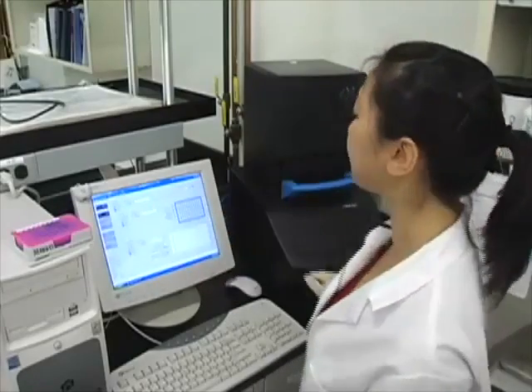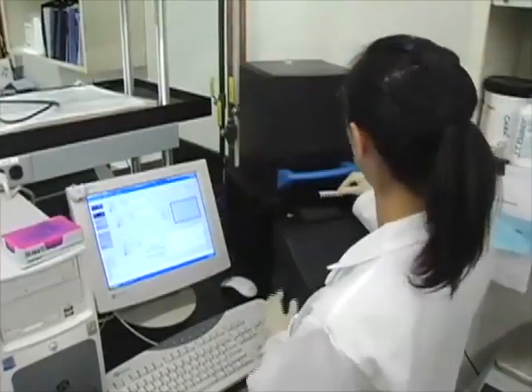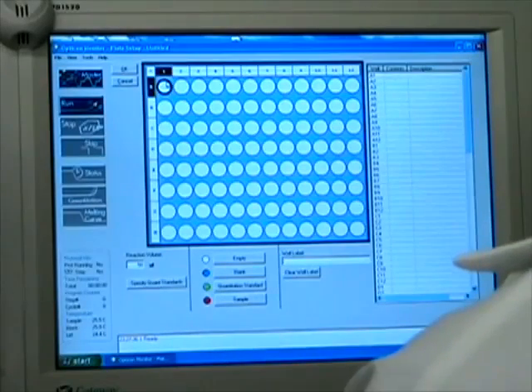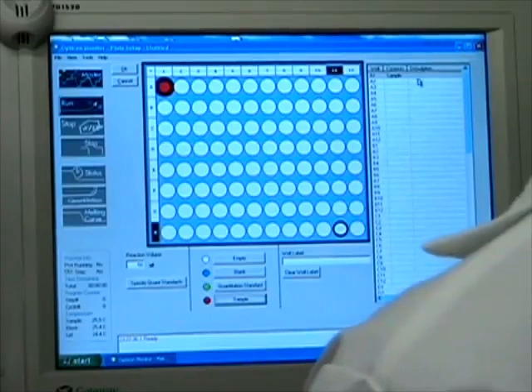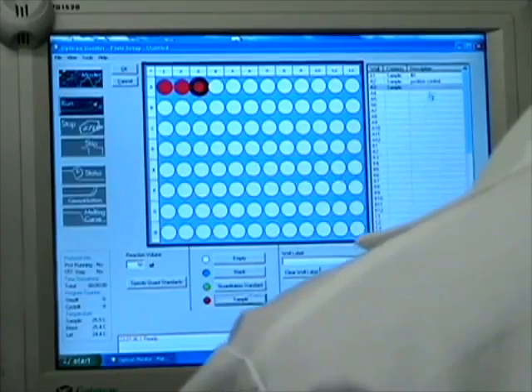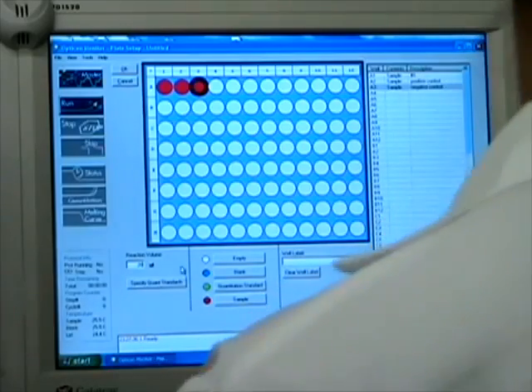So I've gently vortexed our PCR and DNA mix, and I've spun them down, and now we're ready to put them into the qPCR machine. What we're going to do is first load our samples into the Opticon PCR machine. And I'm going to make a new plate setup, in which our first well will be our sample. Our second well will be our positive control. And our third well is our negative control, specifying that our reaction volume is 20 microliters in total.